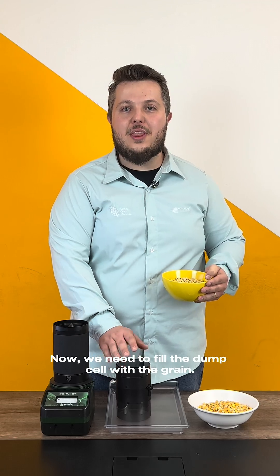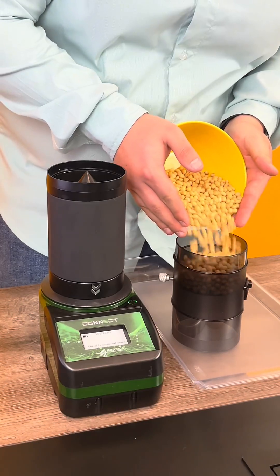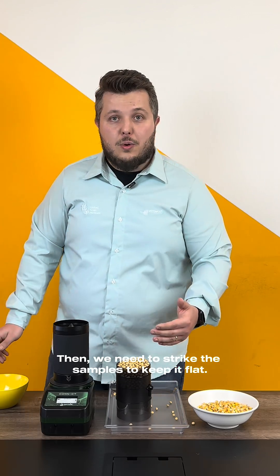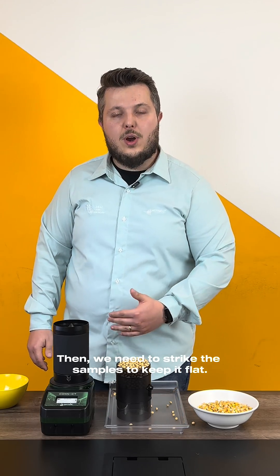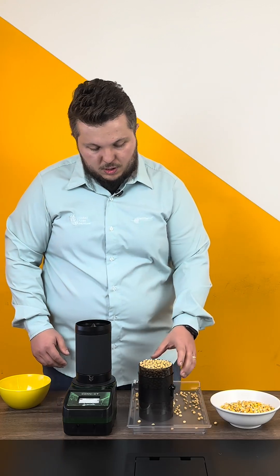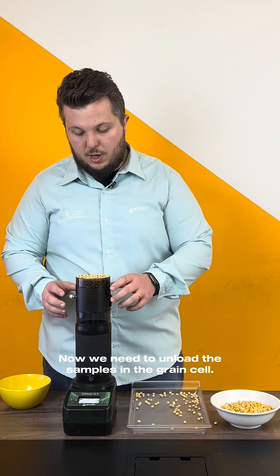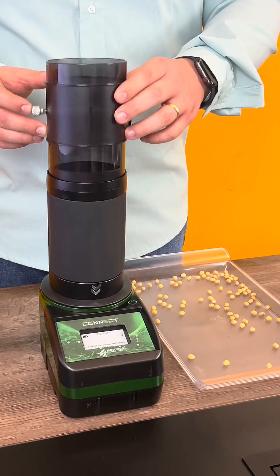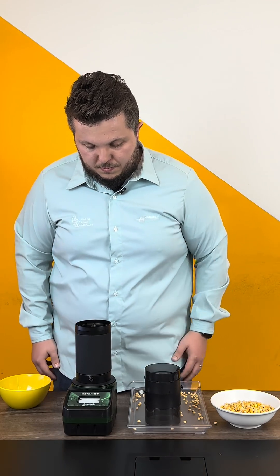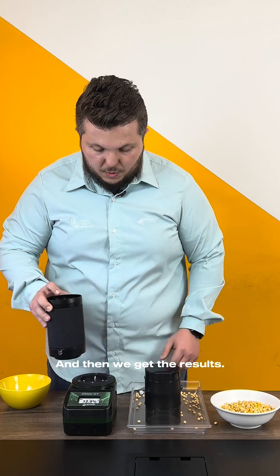Now, we need to fill the dump cell with the grain. Then, we need to strike the samples to keep it flat. Now, we will need to unload the samples in the grain cell. And then, we get the results. Let's do this.